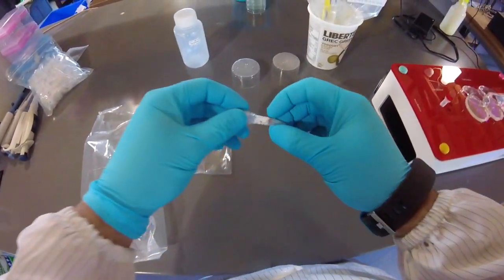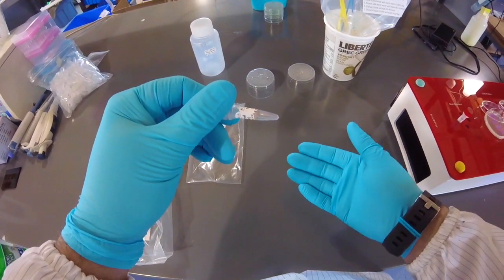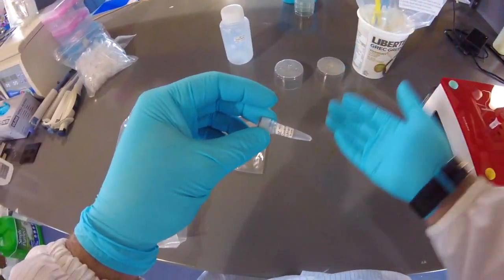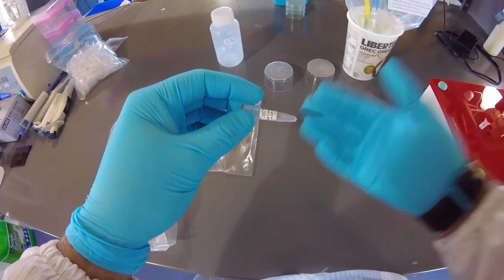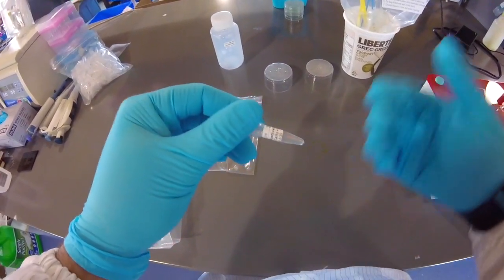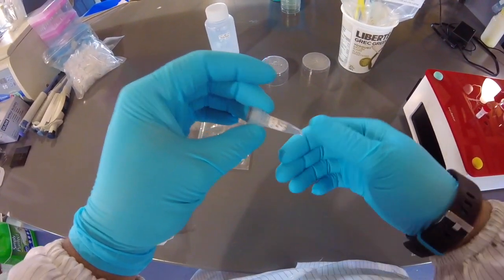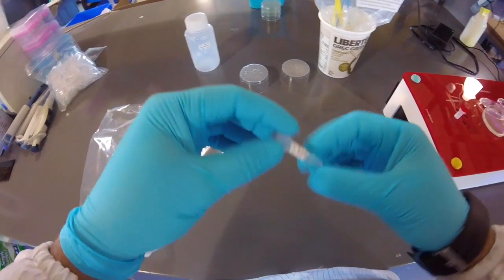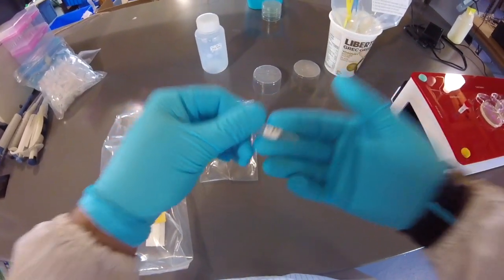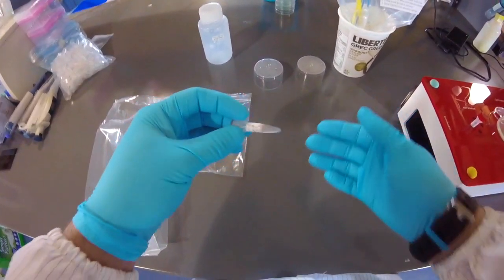All right, so these cells here, the positive control cells, they've already gone through this procedure that you went through yesterday and you're going through today. They already have a plasmid in them for creating the antibiotic selection resistance, as well as a color-producing protein pigment, and then, of course, the origin of replication. Okay? And so when you put these on a Petri dish, the plus plate, that's sort of like your expected result, right? Because these are already engineered. You're just going through the engineering step now, but ultimately the cells should be similar.